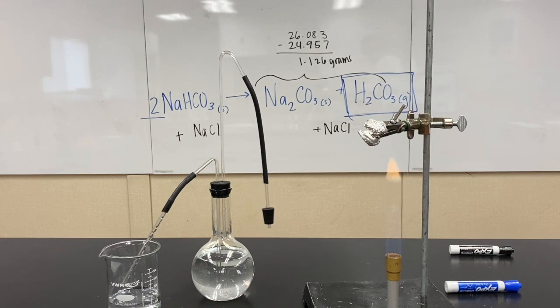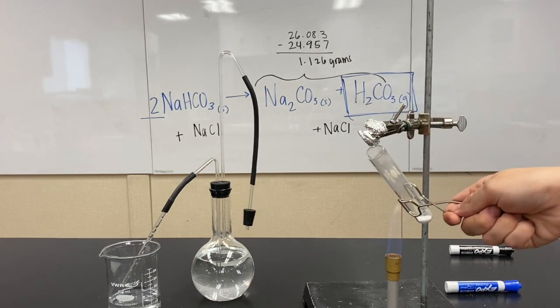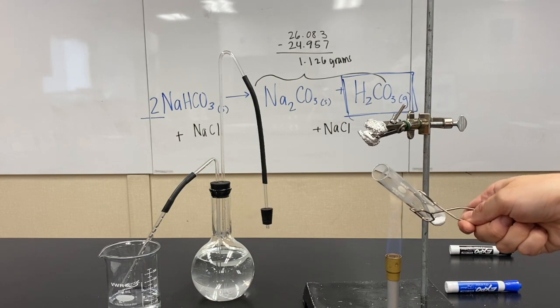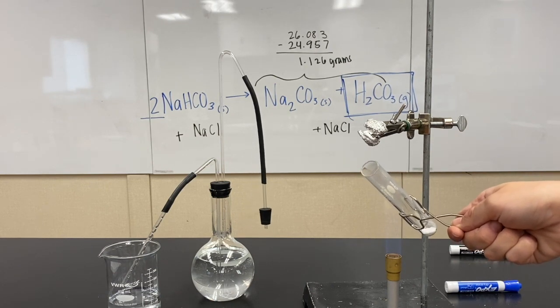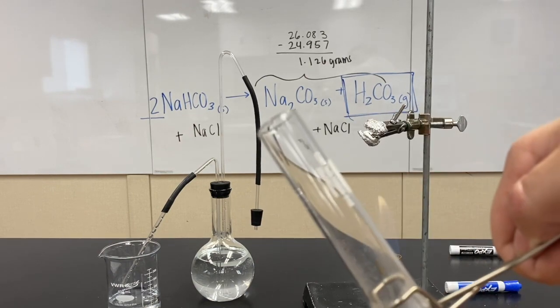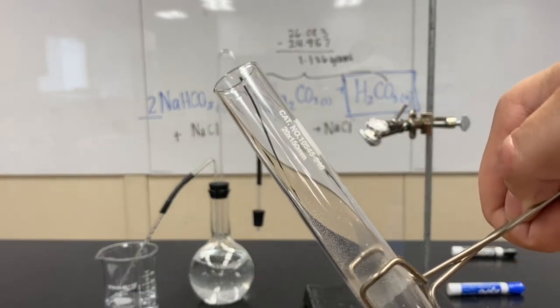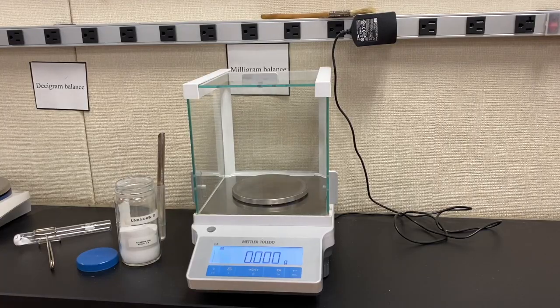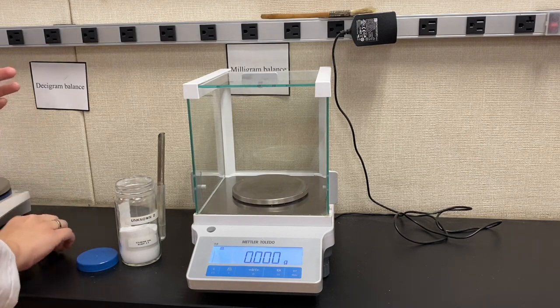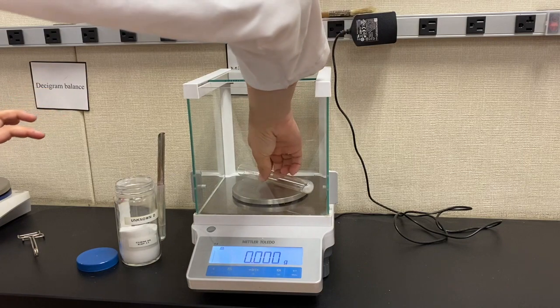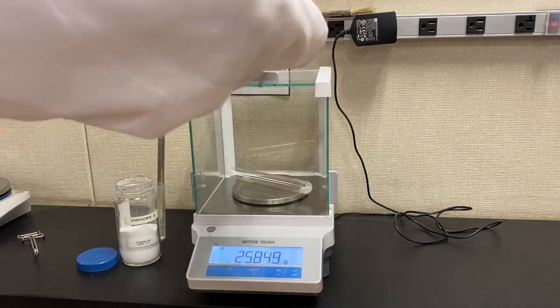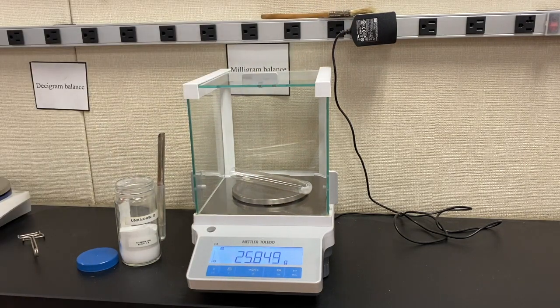Now we evaporate the condensation that's left on the sides of the test tube. Very good. Let's go mass it. Okay, back at the weighing station. Ta-da! There we go.